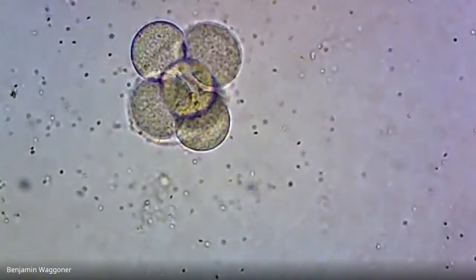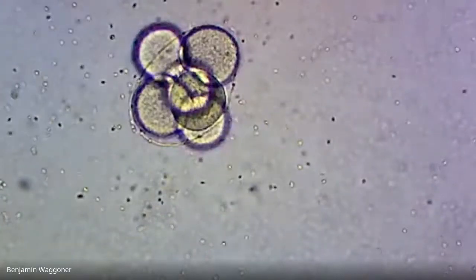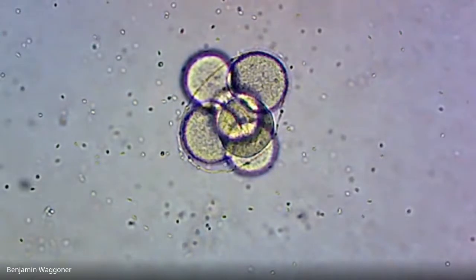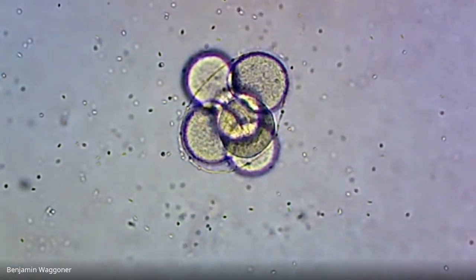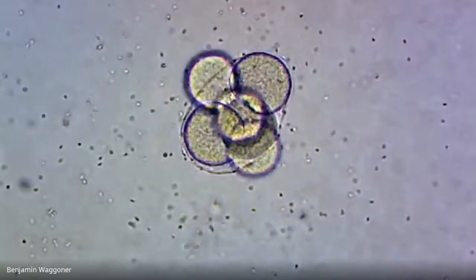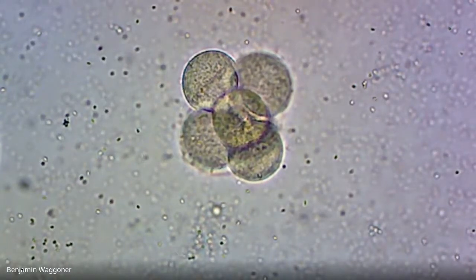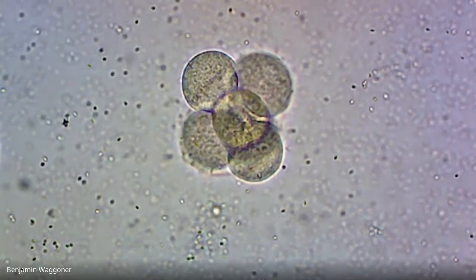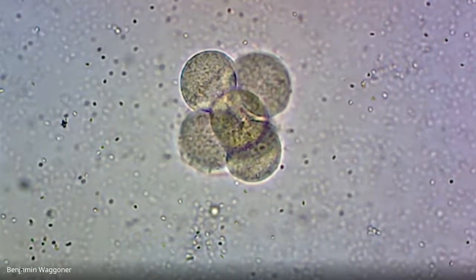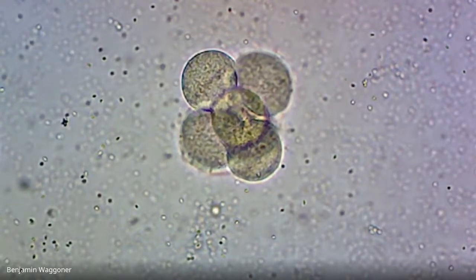Although this one is actually not, because that looks like a 5-cell embryo with a distorted fertilization membrane. That ain't right. Remember, when you add too many sperm, you can end up with an egg getting fertilized multiple times, because the more sperm you add, the greater the odds that 2 of them will just happen to penetrate at exactly the same moment before the blocks can start. And when you end up with a double fertilized egg, or sometimes more, you can end up with weird cell division patterns because, of course, the cell is not diploid. The chromosomes can't divide evenly. And yeah, you can get pretty non-standard, downright weird patterns at this stage.